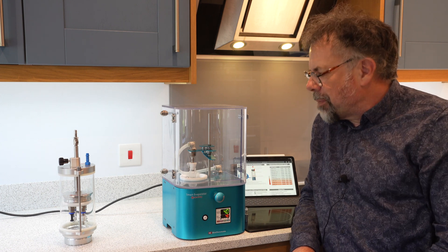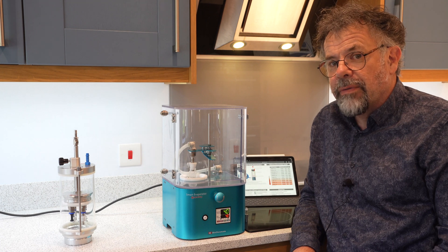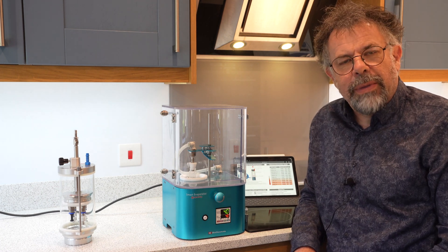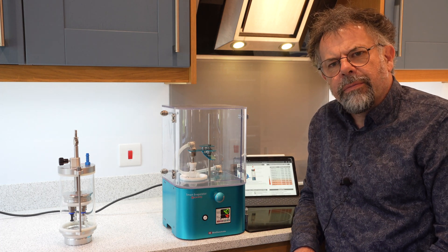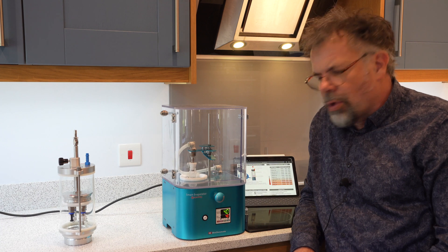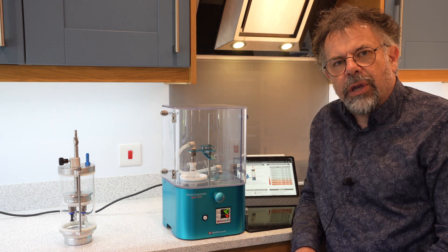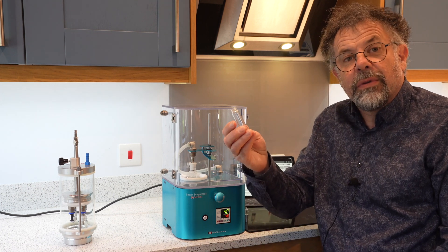The Smart Evaporator evaporates solvents in a very different way to a rotary evaporator. It doesn't replace a rotary evaporator but it's complementary. As a complementary device, it offers a much more efficient, secure and safe evaporation in tubes or vials of any size.